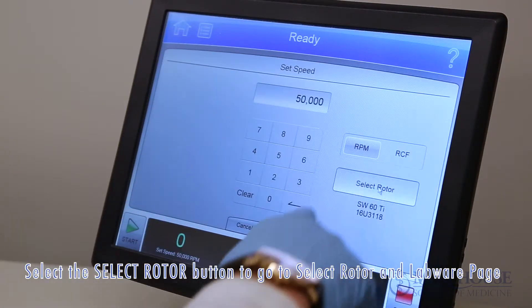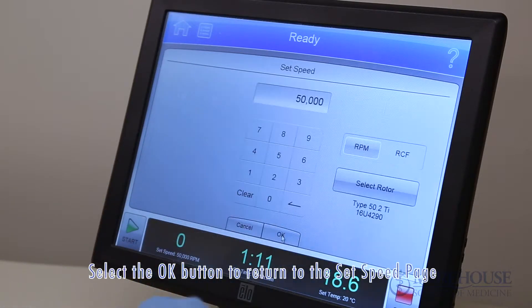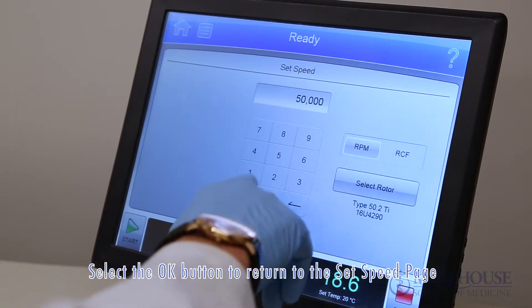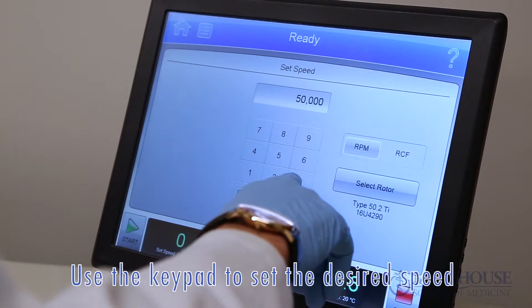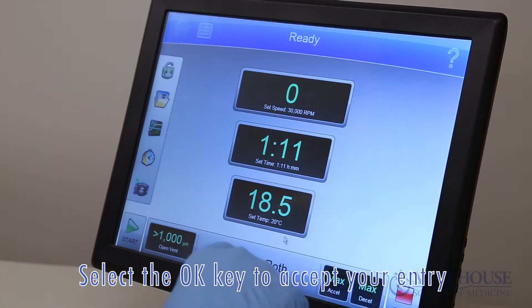Select the select rotor button to go to the select rotor and labware page. Select the OK button to return to the set speed page. Use the keypad to set the desired speed, then select the OK key to accept your entry.